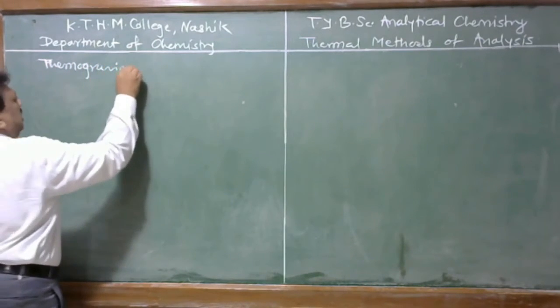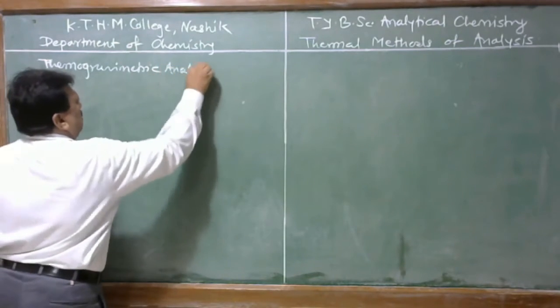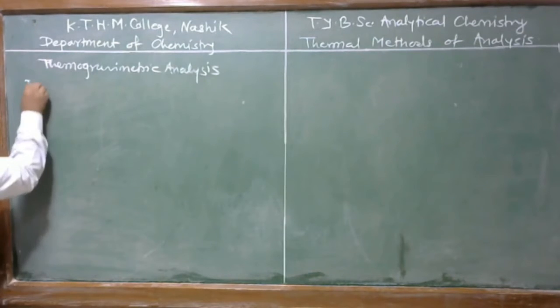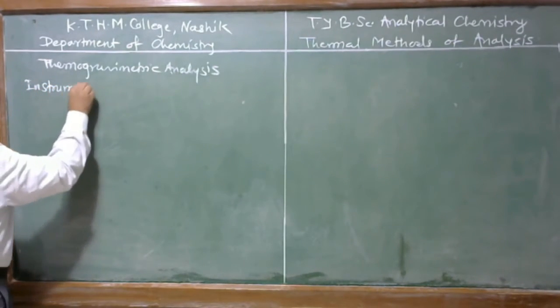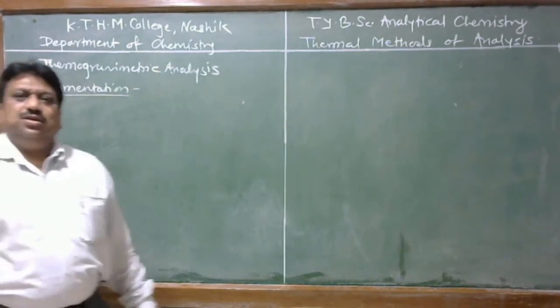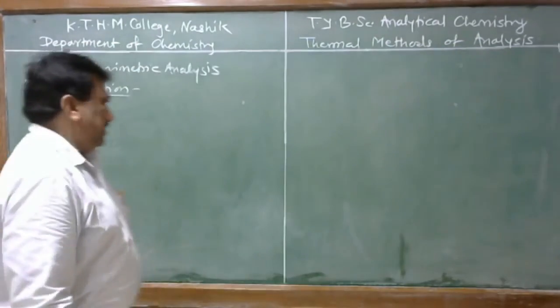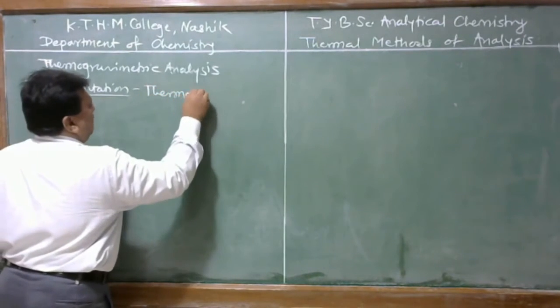Thermogravimetry analysis. Instrumentation. The instrument which is required for a thermogravimetric analysis is called a thermobalance.